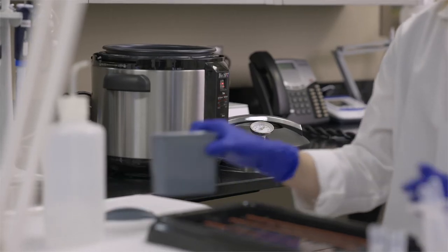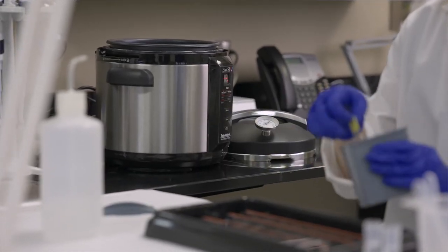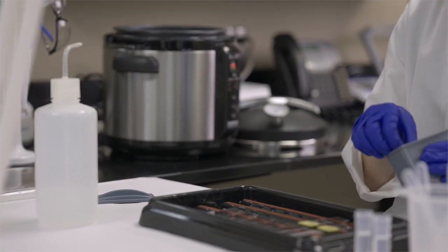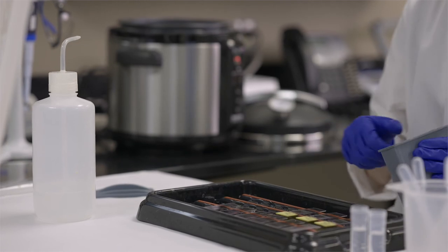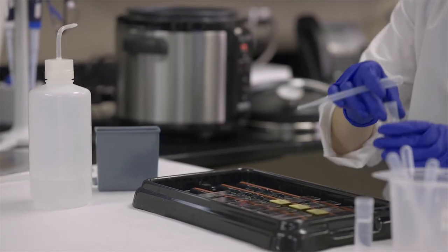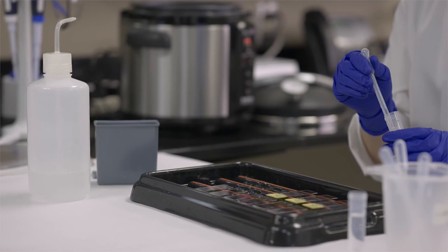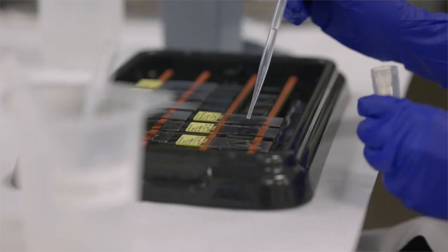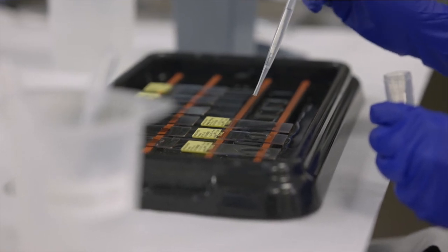A new addition to our staining menu is immunohistochemistry, IHC. We currently offer smooth muscle actin, GFAP, microglia, insulin, glucagon, and von Willebrand factor on five different animal species. We will continue to grow our menu of stains based off of client demand.